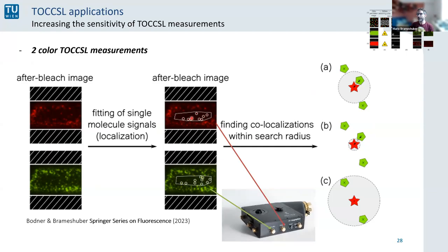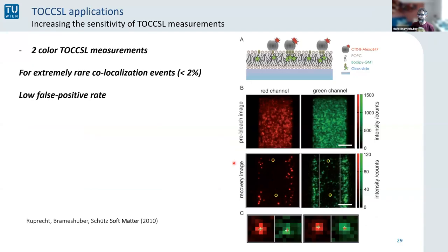The reason why it's still very important to have a good beam splitter is to be perfectly in focus in both images. And this is what we also found to be a very critical point if you have low light applications: to have both images perfectly in focus. Either you can build your own image splitter, or you can use commercial ones with some correction lenses, but still it's not perfect. With our own image splitters, we were able to really finely tune the focus and to get both images perfectly in focus. Okay, why is the two-color localization sometimes better than the one-color brightness approach?